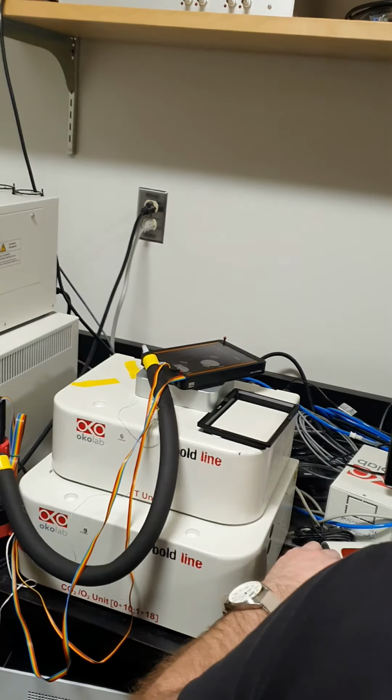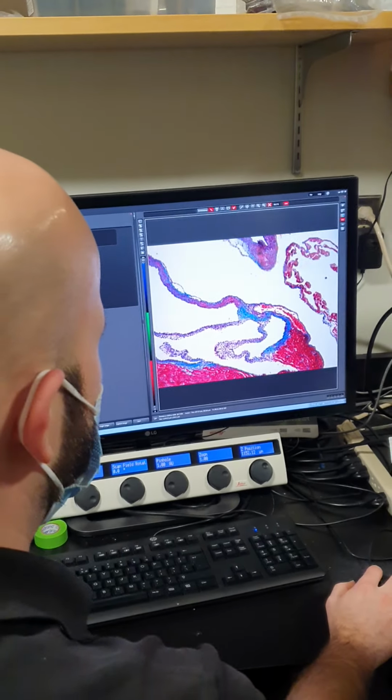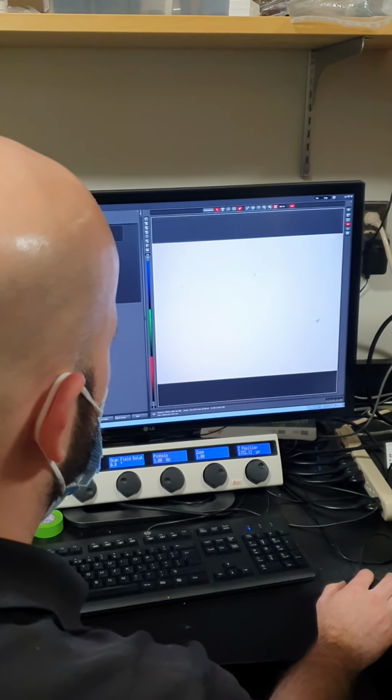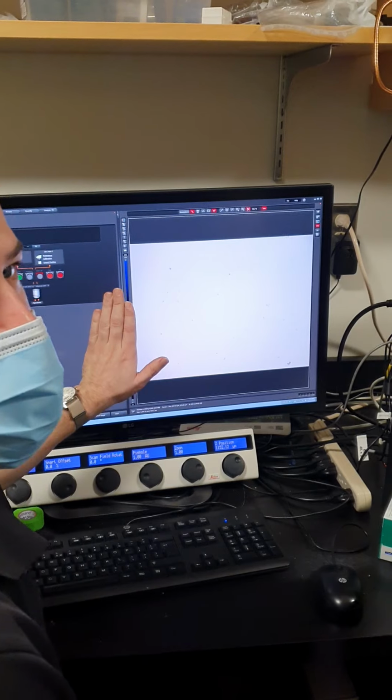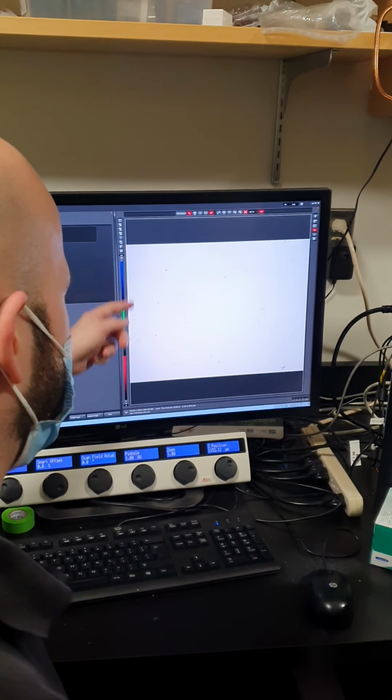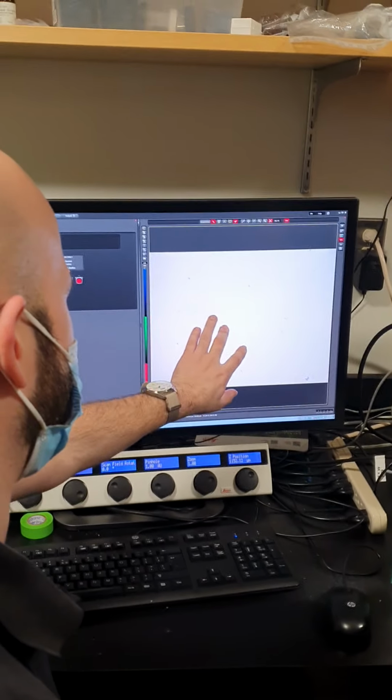And then the other thing is compensating for the potential that the illumination intensity isn't perfectly even across the whole field of view, and that sometimes it's a little fainter, for example, in the corners of the image than in the center.